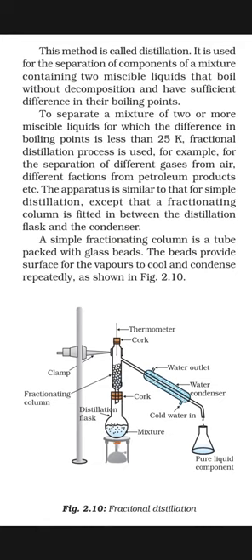So now what is this method called? This method is known as distillation. This method is used to separate mixtures of miscible liquids, which means liquids that have dissolved in one another, and the two miscible liquids should have a sufficient difference in their boiling points. Because water is at 100 degrees Celsius and acetone is at 56 degrees Celsius, there is a sufficient difference between their boiling points.